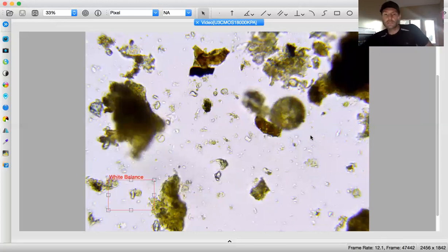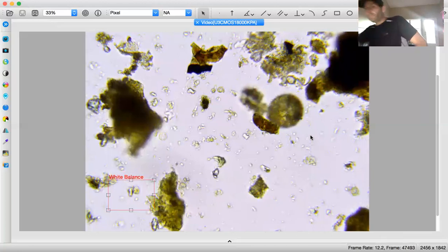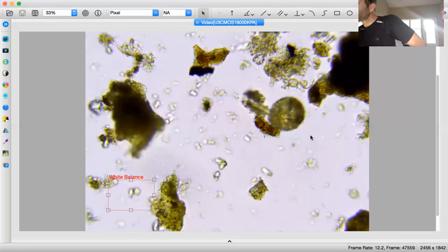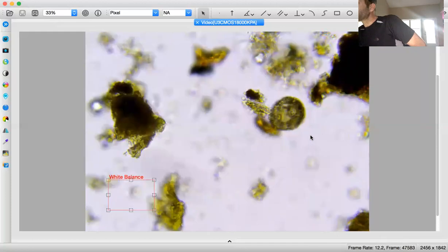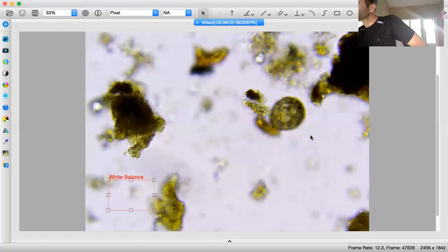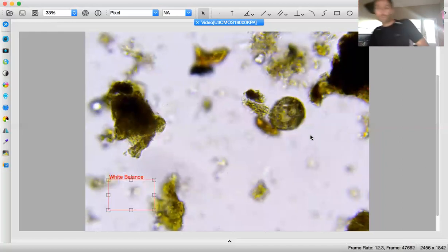Oh, I don't know. Wait, that's just one moving it. Oh, crap. Oh, yeah, that's an arcella. And that is the opening. That spot on top and that little circle I saw is inside the orb. So, yes, that is indeed an arcella. Man, it is a lot trickier to see on the screen. So we've got an amoeba.